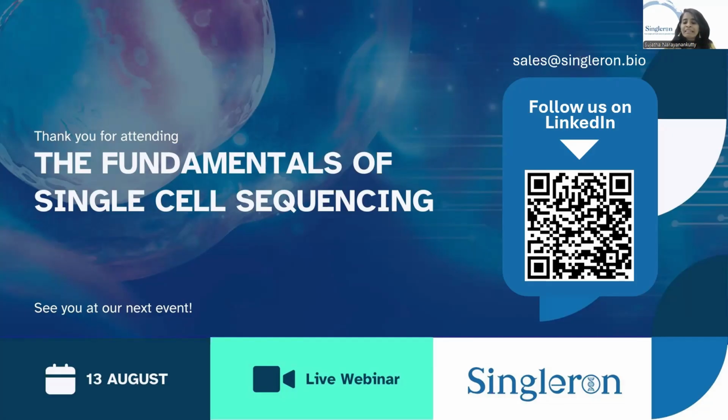So I'd say at least 3 is a good start. Of course, that also depends on sample availability and how much funding you have to do this research. So this is a guideline, to do at least 3. But even if you have less, I think you can gain insights by running a single cell experiment. Sorry, Irene, what was the second part of the question?